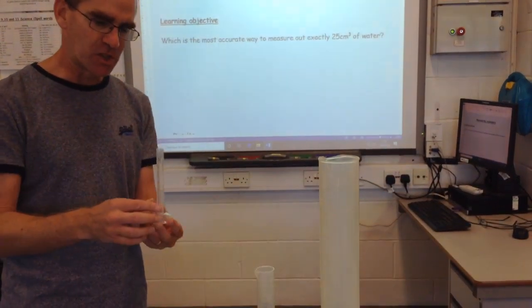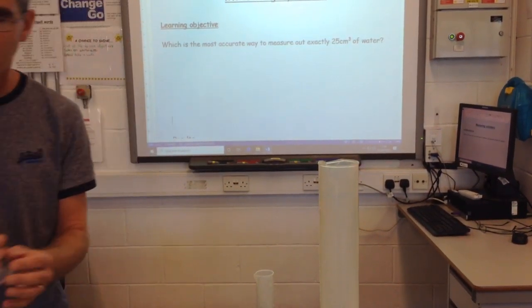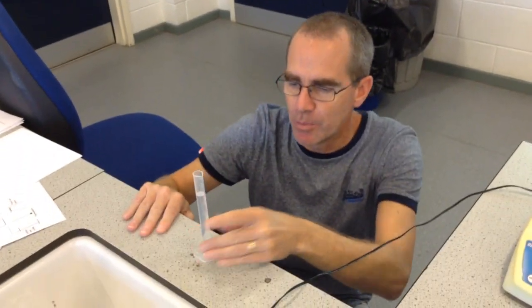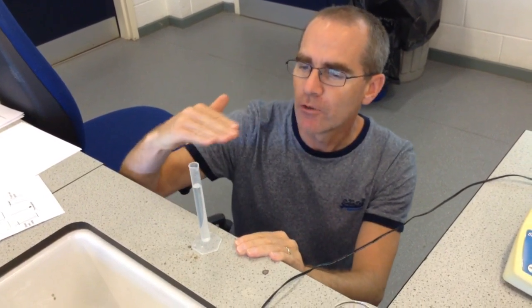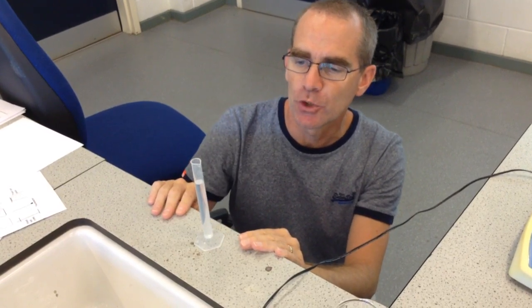The first thing I'm going to do is start with my 10cm cubed measuring cylinder and fill it up to the 10cm cubed marker. Whenever we read measuring cylinders, it's very important we put it on a flat surface, keep it steady, and line our eyes up level with it. I'm happy that that is 10cm cubed.